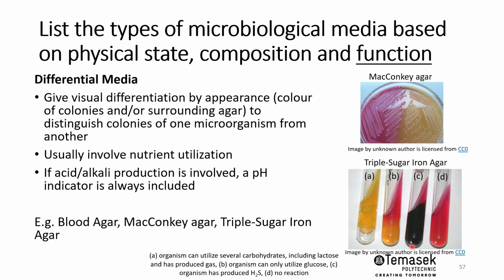All right, so some of the microbes you can come to expect with such phenotype, like for example, in the case of tube A, you have the yellow bottom and the yellow slant. Typically, these are your E. coli. Okay, they also produce gas, so they can utilize the three types of sugars here.